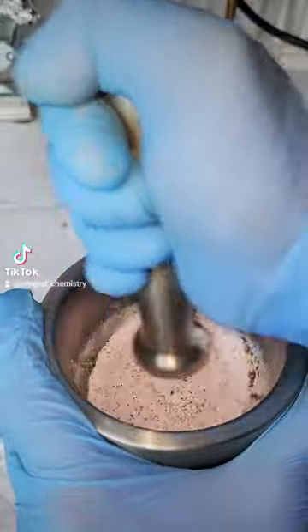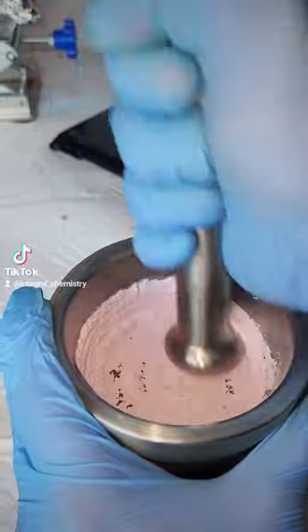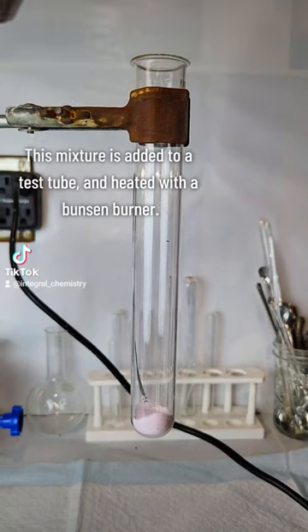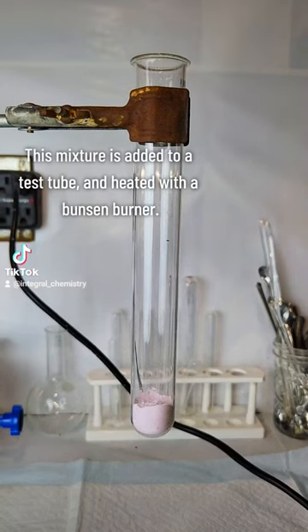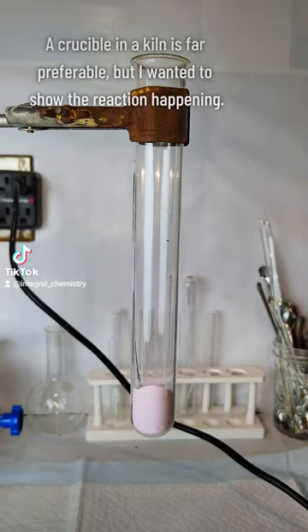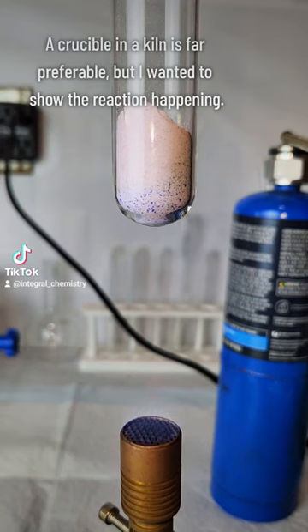The result is a fine pink powder that would ordinarily be loaded into a kiln and cooked at 1200 degrees Celsius for about an hour, but that's no fun to watch. Instead, I load the mixture into a test tube and heat it with a Bunsen burner so you guys can actually see the reaction going on. This method is far less efficient than a kiln, but I do like the footage that I got from it.